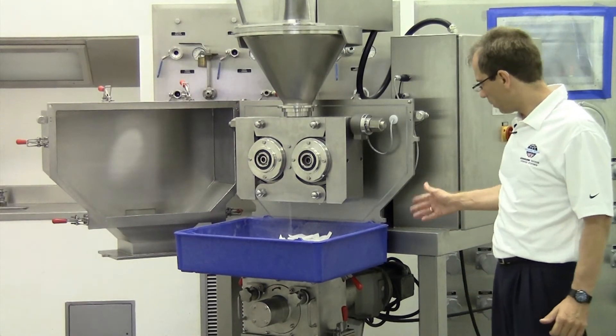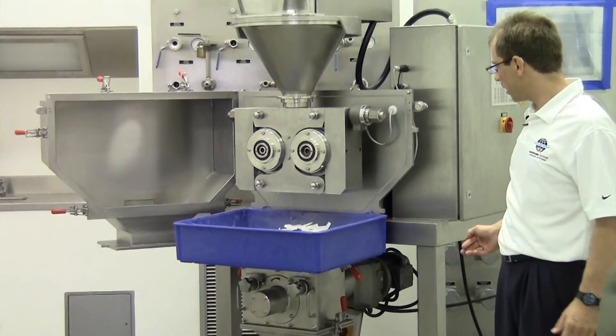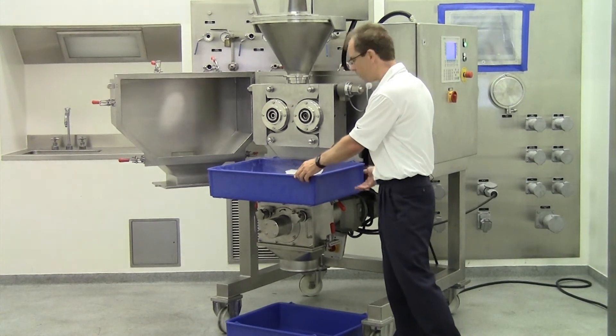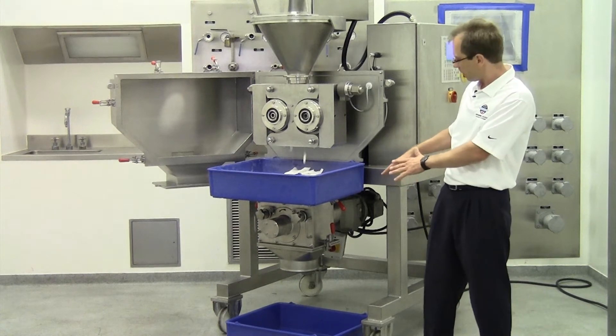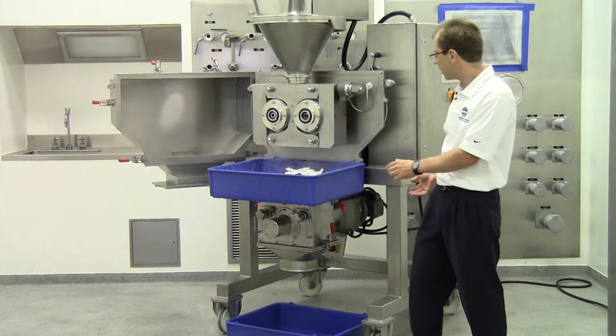For demonstration purposes I would like to show you now also the crushing of the flakes. Here's a tray with the material and the material will be crushed underneath. Normally a bag will be fixed and tied to the flake crusher, but to show it better to you we don't have that here.